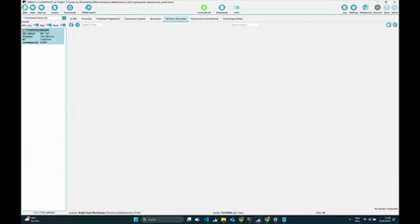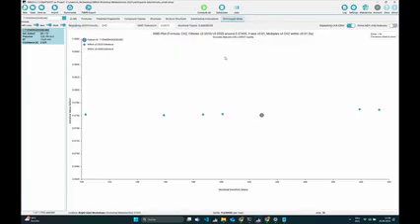And again, if you want to follow along, I will now look at this feature which ends in 482, and now look at this new tab which appeared, homolog series, and this is a Kendrick mass defect plot. And here you can look at potential homologs in your homolog series. The setting that you have for this is the repeating unit formula, which you will have to adapt if you are interested in a particular homolog series.